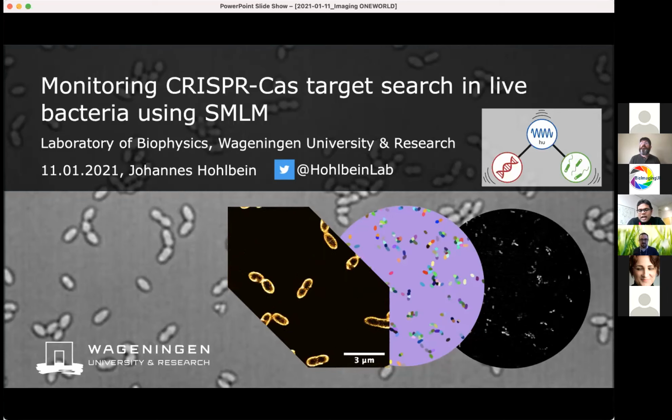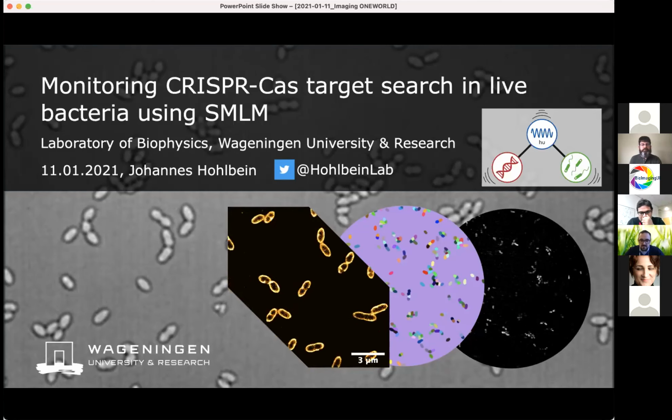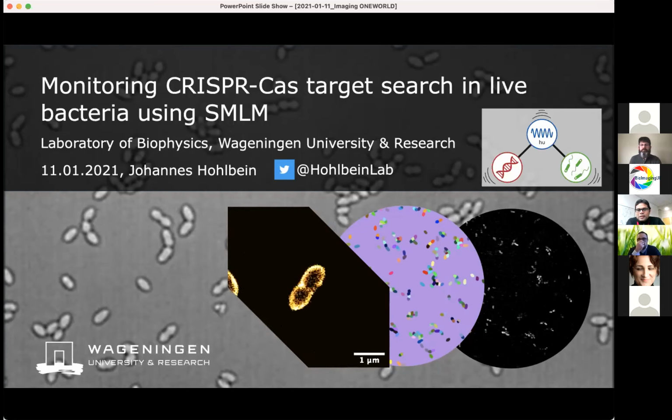Some of you might know the NanoImager. Some of you might know another compact microscope from Craig's lab. Seamus Holden is working on something similar. Then there's one at Warwick, and then Aurox, and the confocal group, RCM, in the Netherlands. So this is the modern era of compact, low-cost microscopes.